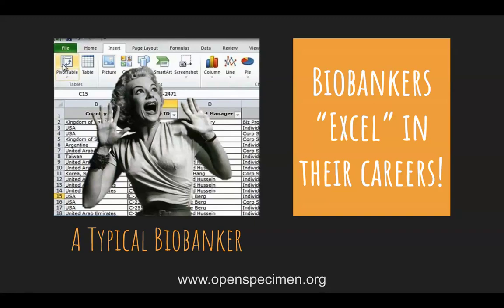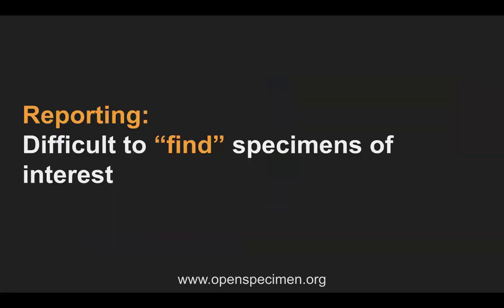Other cases are where people are using software meant for LIMS, which are more generic laboratory information systems and not necessarily meant for biobanks. All this puts a lot of restrictions on how a biobank can use these kinds of software.